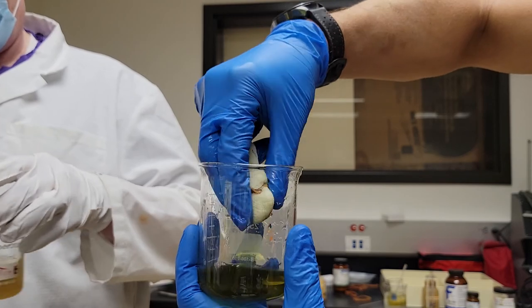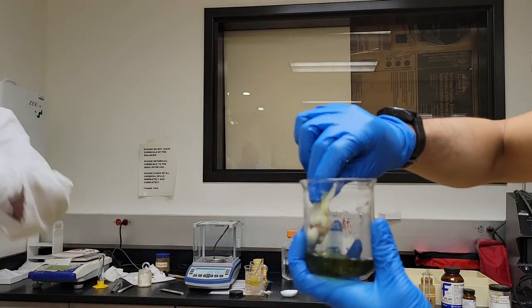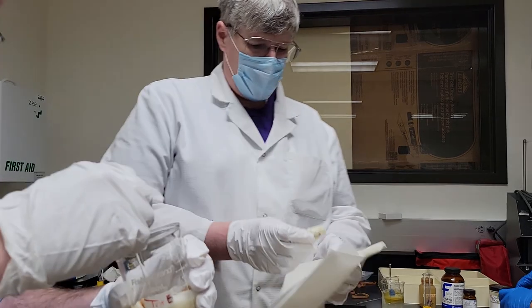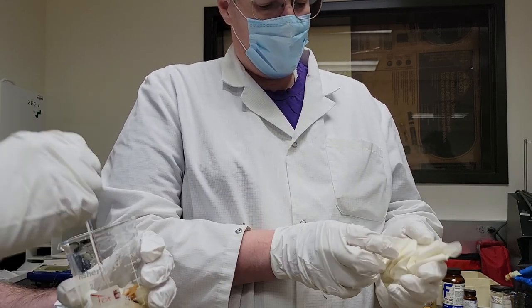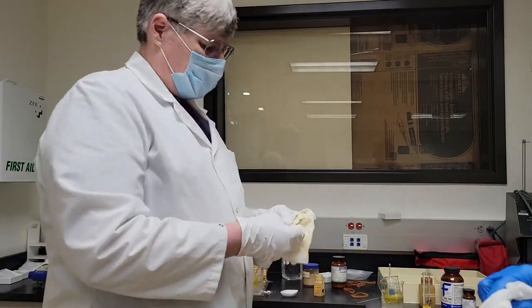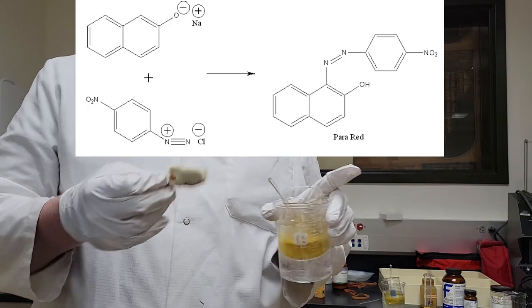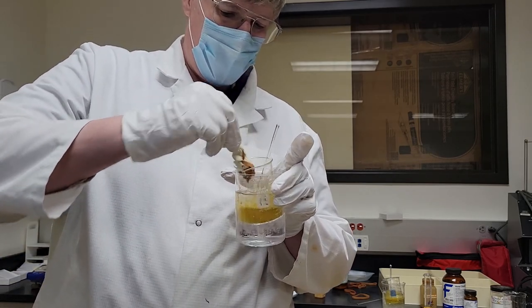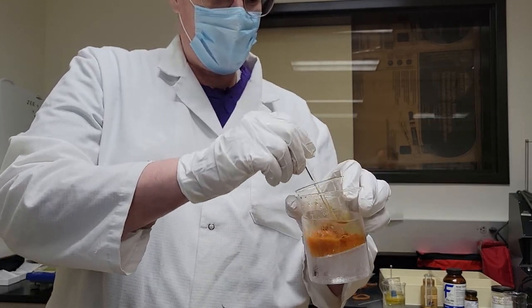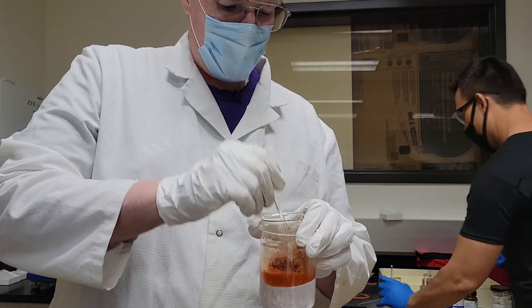We have no idea if mine's going to work or not — I'm thinking it's going to work. We don't know what color it's going to be. The instant this naphthoxide touches the diazonium I made in here, it instantaneously turns blood red. I pulled both the ice bath and the beaker and dropped my cloth in there — this is really better when you're just doing it on the countertop. Everything has kind of turned a blood red color.